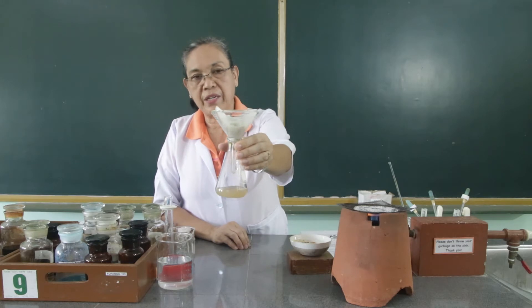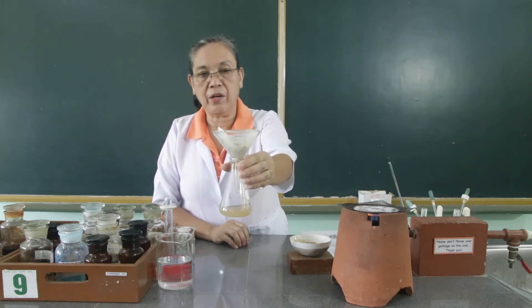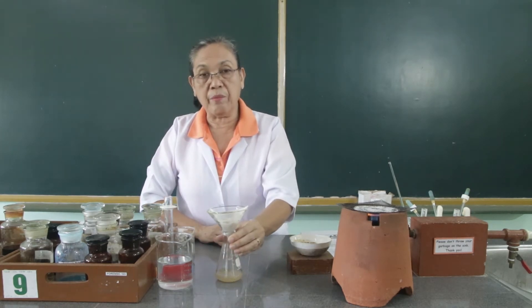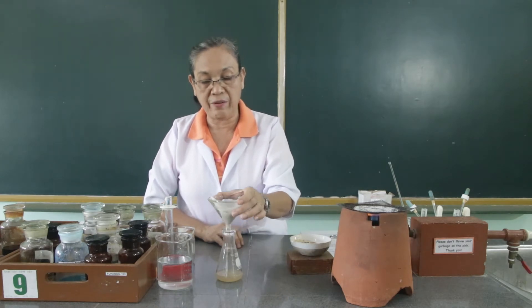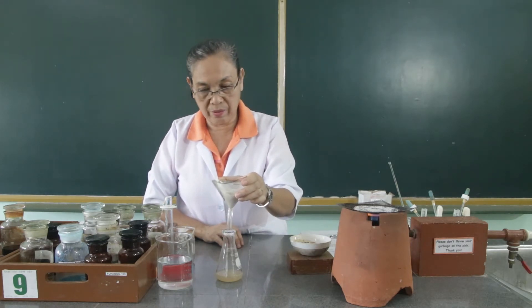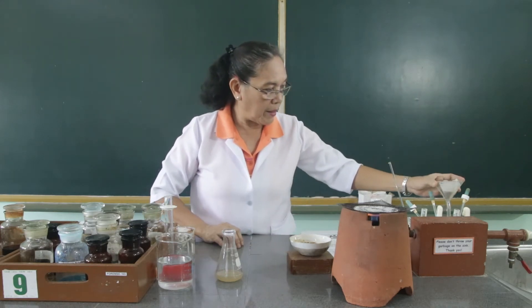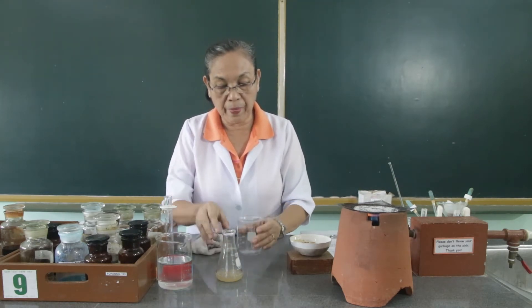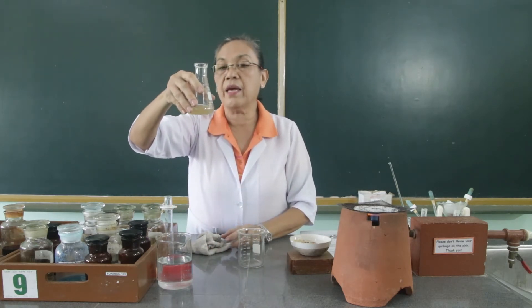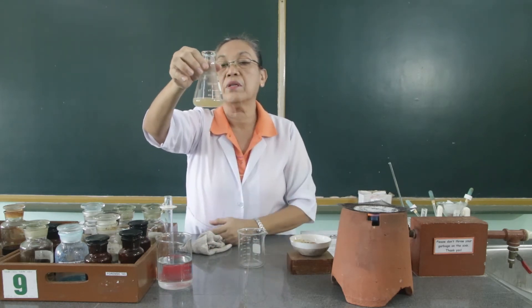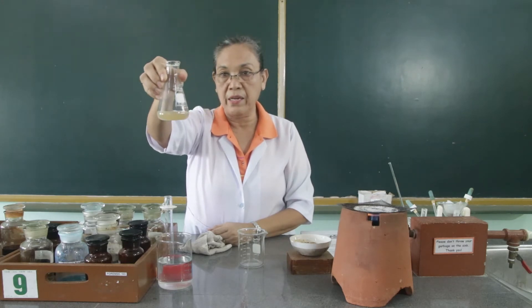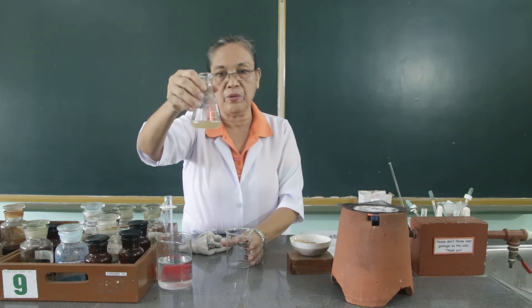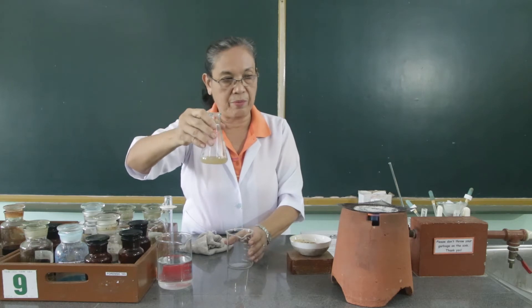We have already collected the filtrate from the boiled meat of the seashells. The next step is we are going to boil this again to concentrate it to half its volume. We will transfer it to this beaker. Since this is about 25 ml, we are going to concentrate it to about 12 ml after boiling.